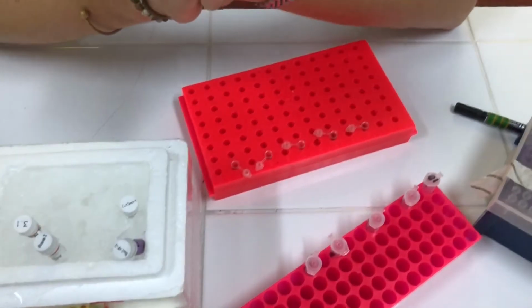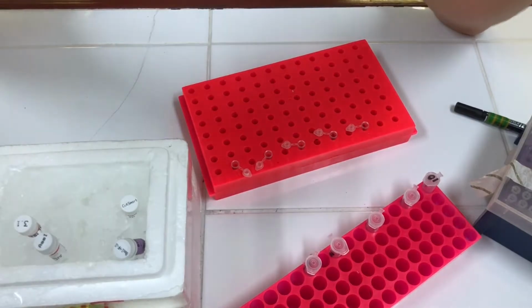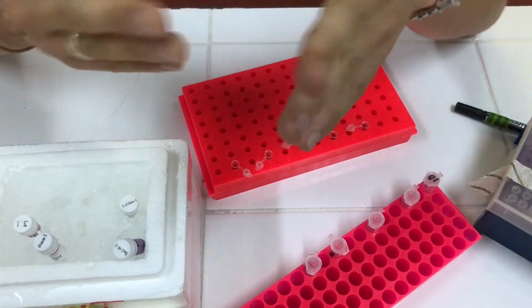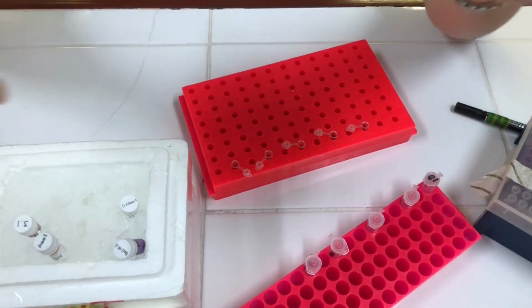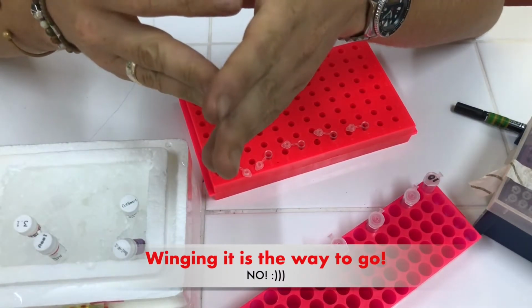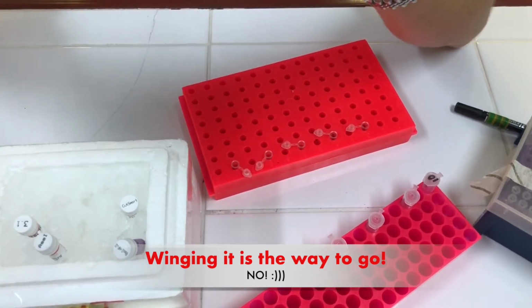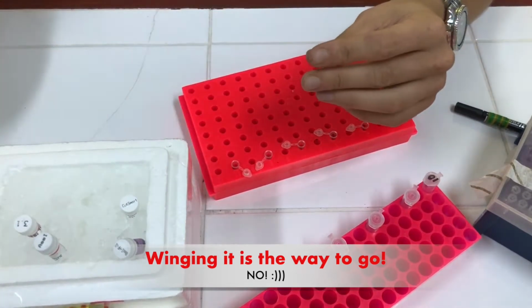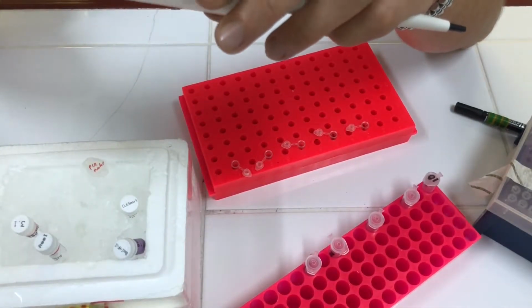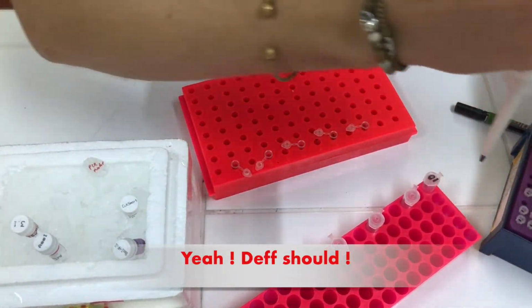So I'll do a dilution now. I'm not gonna add 17 microliters of DNA. I'm just gonna add 5 microliters of DNA, or let's just say 7 microliters of DNA, 10 microliters water, 2 of buffer because it's 10x, and 1 microliter of enzyme. I should go about this, you know, more technically, but what can you do? So 10 microliters of water in each of these tubes.